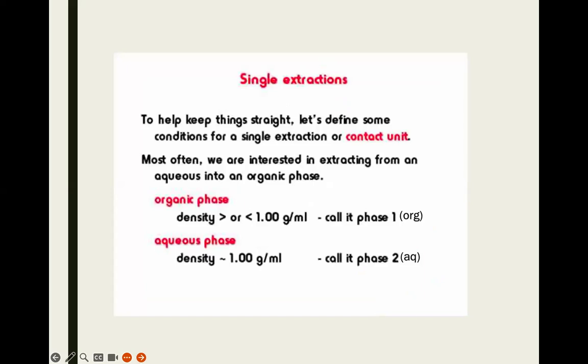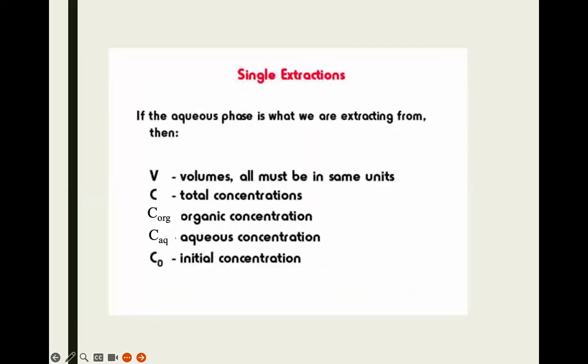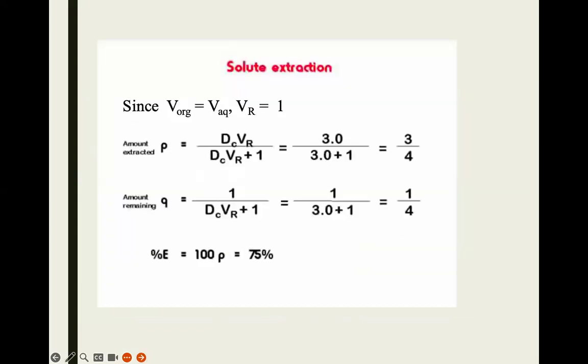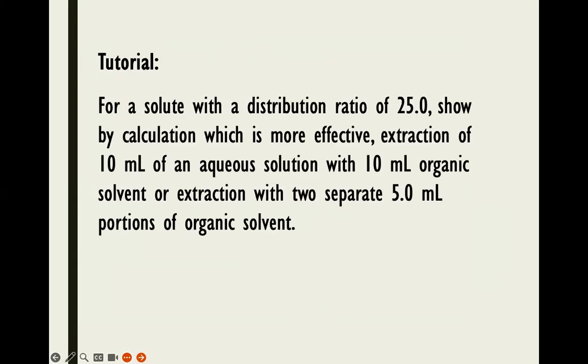So usually it's not enough to just use a single extraction. It's not enough. So we have to use multiple extractions. This is of course single extraction. Let's move on to multiple extraction.